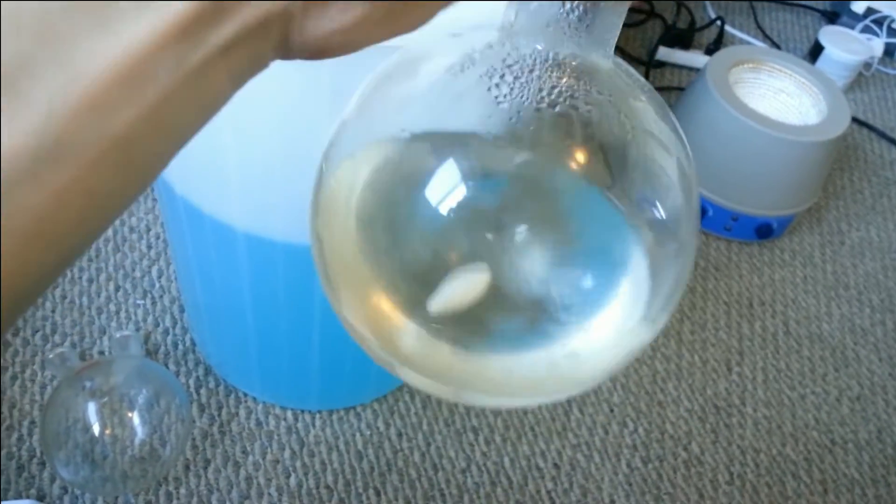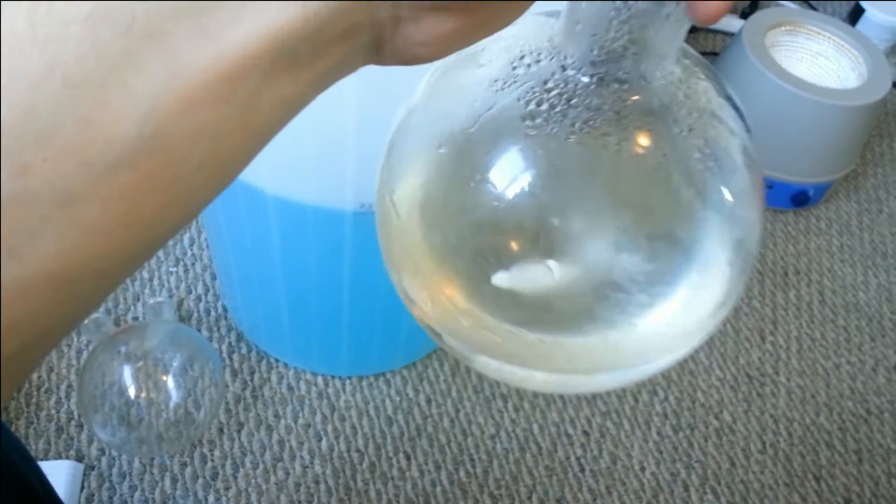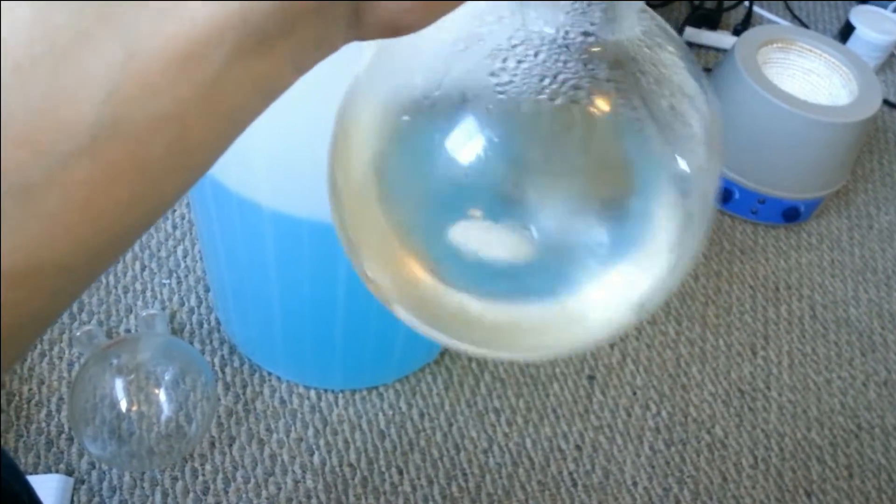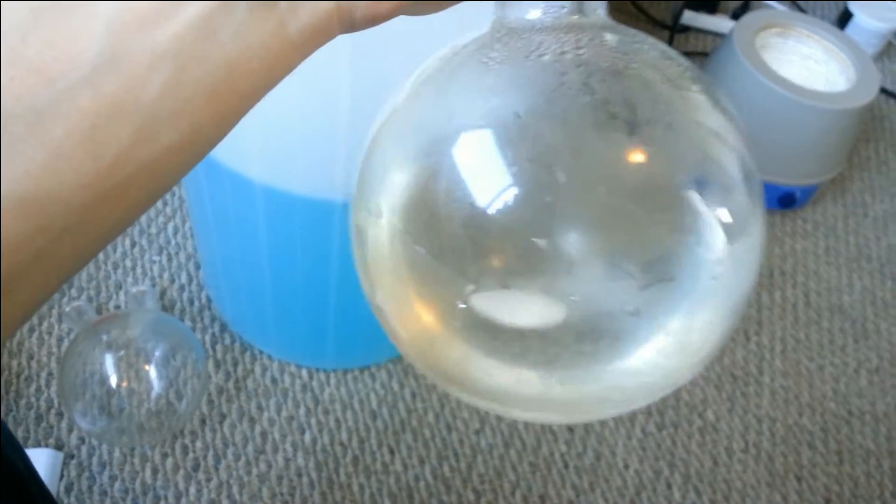What would happen is I would boil the solution, the water would boil off and be condensed and collect in a separate flask. Then the salt would be left behind. I have therefore been able to separate the water from the salt solution.